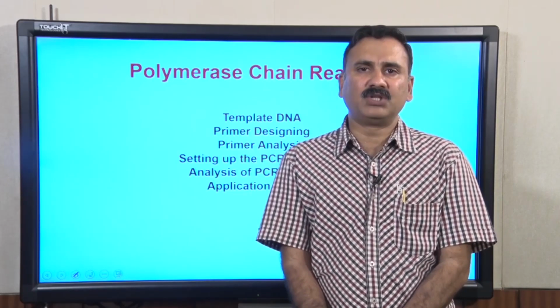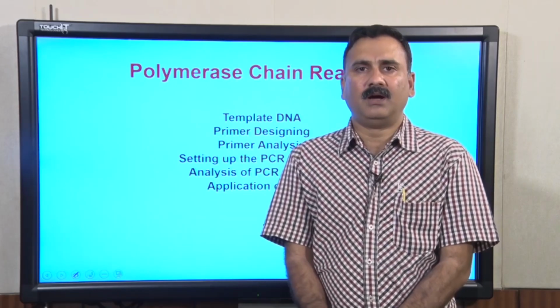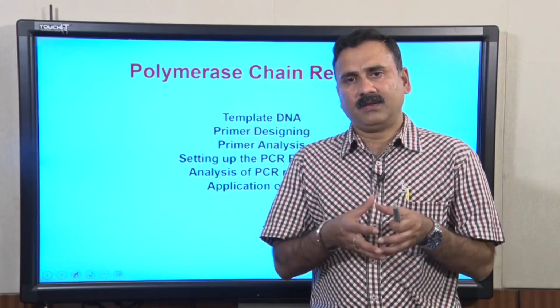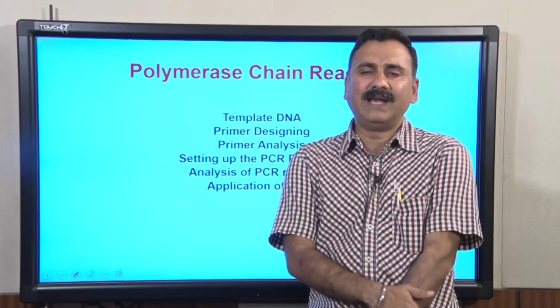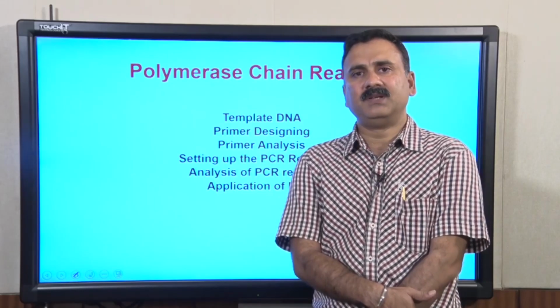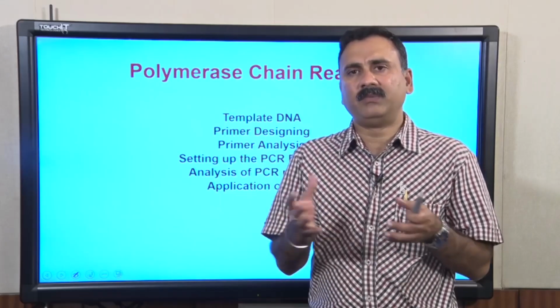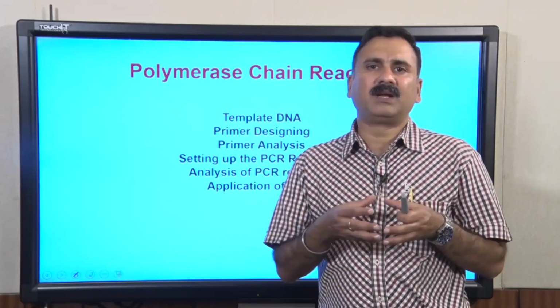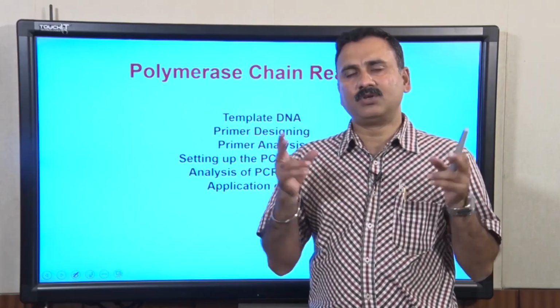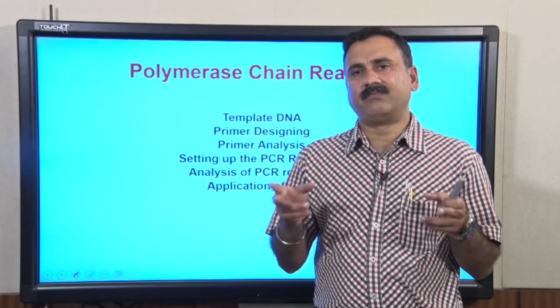Let's continue our discussion about the polymerase chain reactions. In our previous lecture we discussed the different steps and how the technique has evolved over a couple of decades, and how the polymerase chain reaction was inspired by DNA replication, and how people have mimicked similar steps under in vitro conditions to amplify a shorter stretch of DNA using site specific primers.